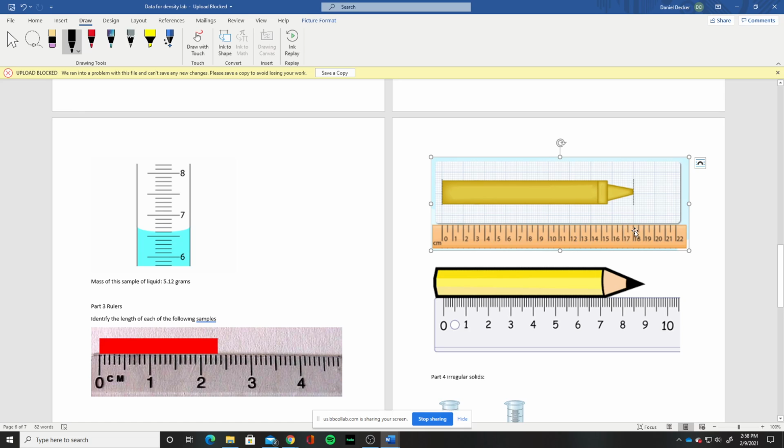So you have the centimeters and the half centimeter marked. Because there aren't tenths marked, in this case I would only expect you to go to the tenths place. So you would have some number here, like 18 maybe, and then you would put something there, and that's as far as you should go. Since there aren't tenths marked, there's no way I could expect you to know what the hundredths place is, because that's just not possible, not with those markings.